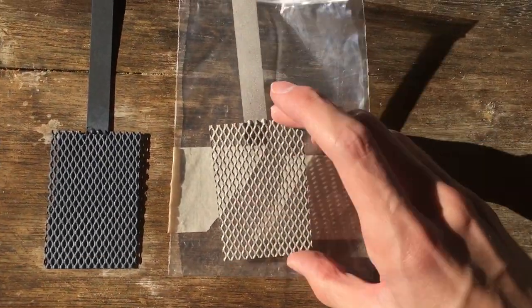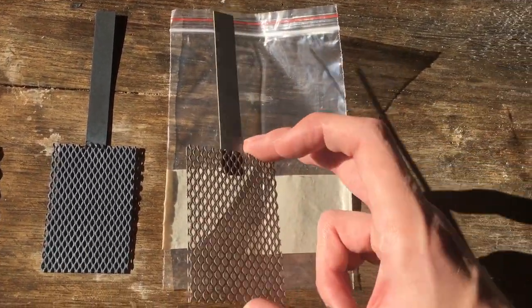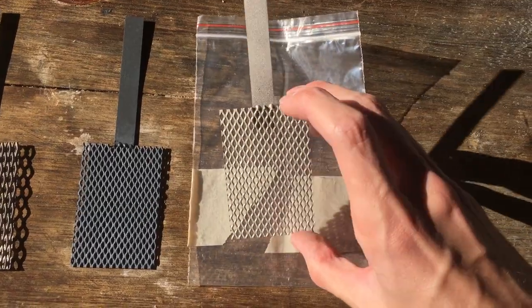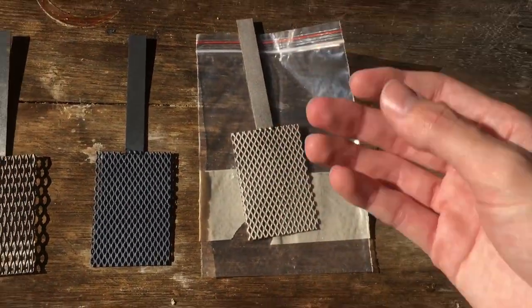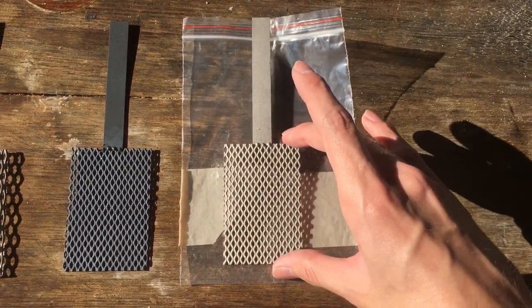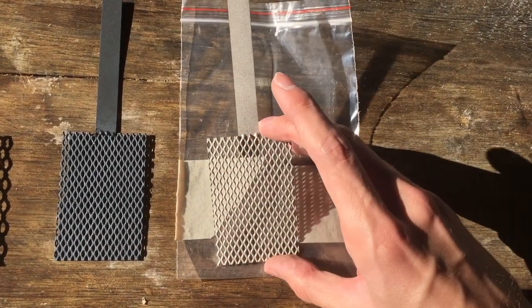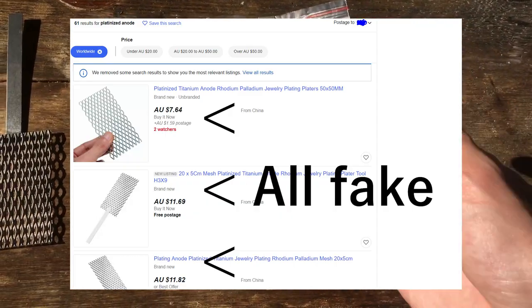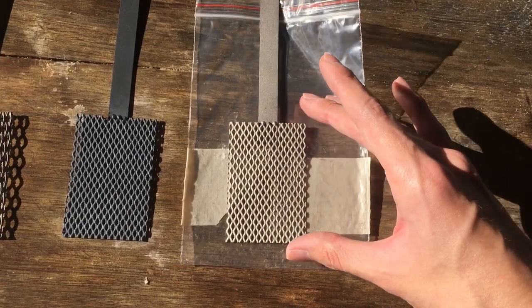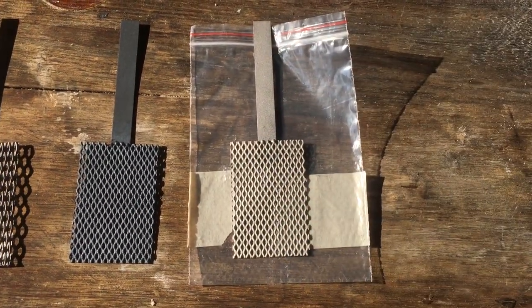So now we get to the bit of the video that the title is actually about. I want to check that this platinum electrode is definitely really platinum coated onto titanium and not some fake — maybe nickel or iron or something like that. The reason I'm doing this is because there are a lot of fakes on the internet. Most of the things you'll see on eBay for platinum electrode are actually fakes, and I've been tricked a couple of times in the past. But I'm almost certain this one's real, and I'd just like to double check.